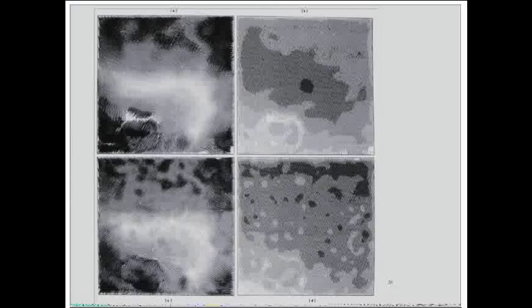As you move further and further out, particularly into zones of low contrast because of the tilt, you get less contrast. So it's only really working in a band in the middle of the image. So presumably the tilt axis is somewhere along this direction. So either side of the tilt axis, in a narrow band, you get good correlation, and it falls off as you get reversals in contrast or zero contrast.